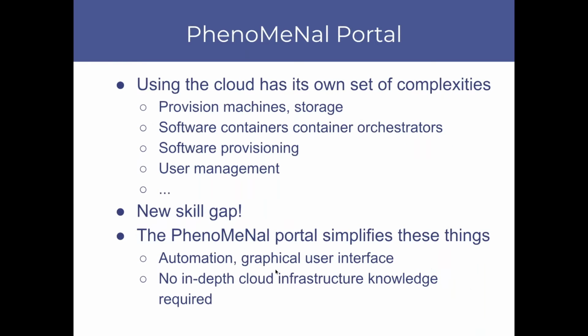Now, onto the PhenoMeNal portal. While the cloud resolves a lot of problems, it obviously introduces its own set of complexities, which means it introduces a skill gap for a new user. The PhenoMeNal portal simplifies these things through automation and a graphical user interface. This means that you can take advantage of a cloud infrastructure without having an in-depth knowledge of how it works.